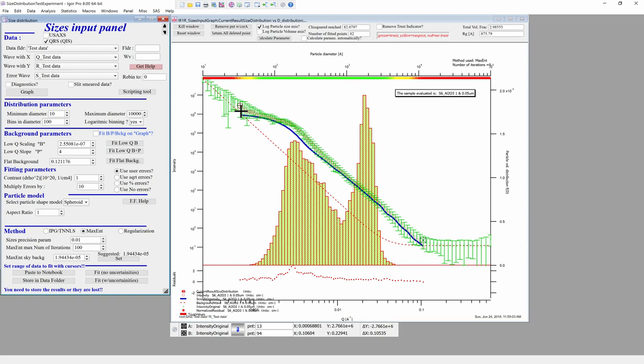Now in small angle scattering, you can kind of see behind the beam stop, so that's why it's kind of washed out. In any case, your Q value which you have here tells you that anything larger than 10 to the 4, even if it would be there, you cannot trust it. So let's go back and reduce the maximum diameter to 10 to the 4 in here.